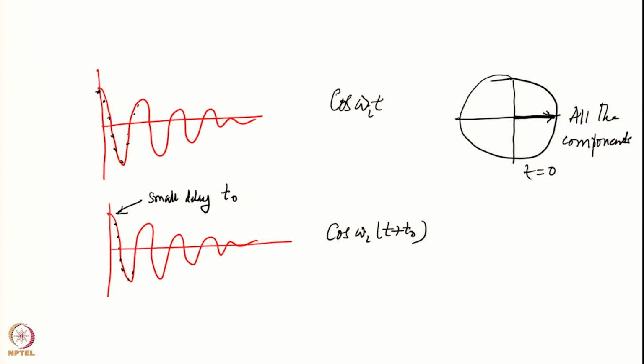Okay. So what does that mean? If I were to represent this in the transverse plane like this, where will the magnetization be to start with? Because T naught is the delay, during this period the different components will have precessed to different extents, right. Although I applied a 90-degree pulse correctly, and the magnetization came to the y axis, I did not start collecting from that point.